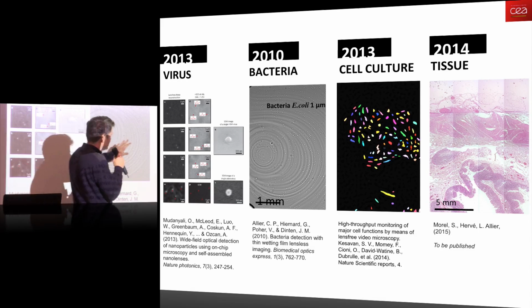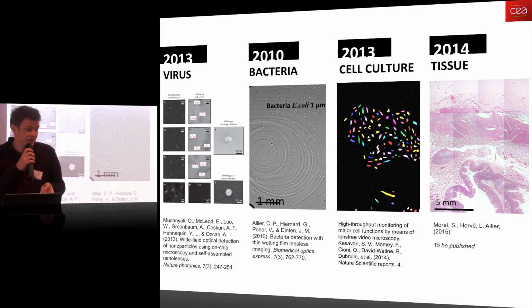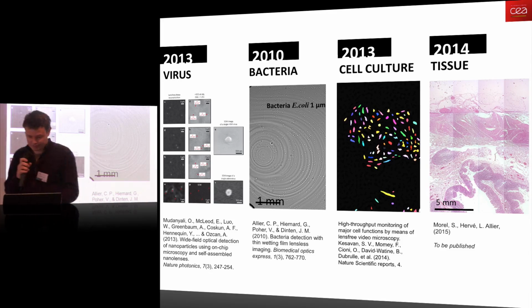Since a few years now, we are very much interested in cell culture in 2D and 3D. And there is a PhD work right now to look at tissue slides. I will explain how we can detect viruses and bacteria with this very simple device, and how we can make pictures of cells and tissue slides.